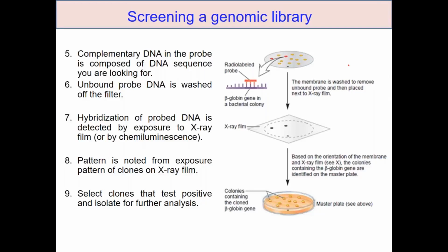So now after that, I'm going to treat this nylon membrane with cell lysis buffer. That is nothing but your lysozyme and then EDTA. By doing so, what happens now? All the cells will be lysed. Once the cells are lysed, the DNA will be exposed. Now the DNA is negatively charged, whereas the nylon membrane is positively charged. So now all the plasmid DNA will be immobilized.